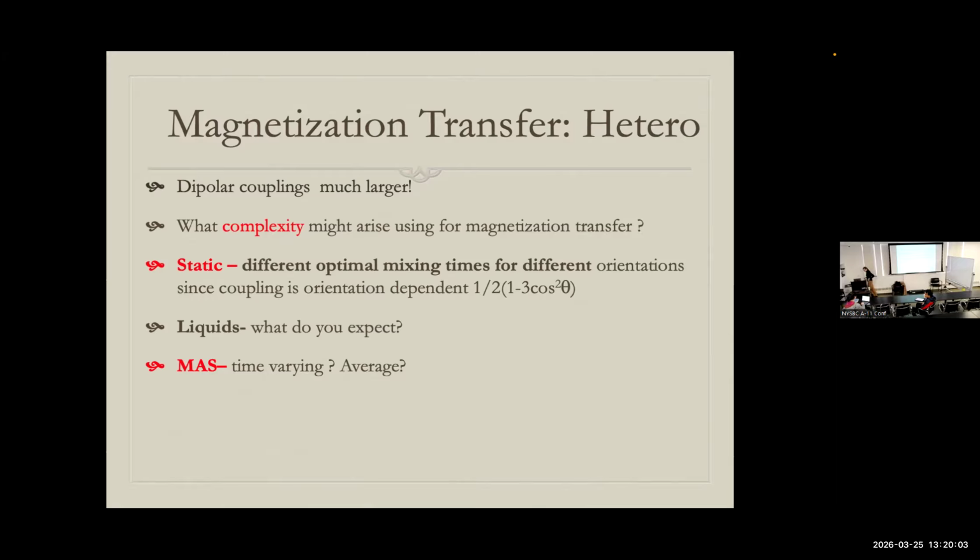Malcolm kept saying no, and David, who was very practical in his spectroscopy, said, I can look at my spectrum and it's clearly phase-sensitive. Finally Malcolm said, let me see the pulse sequence. And he looks at this, oh, you mean for the special case of a NOESY with 90-degree pulses. It is the same thing, right? I asked Malcolm, he denied ever saying that.